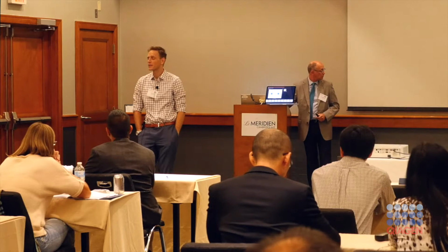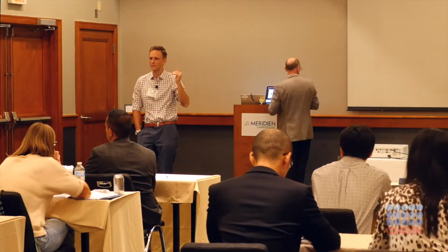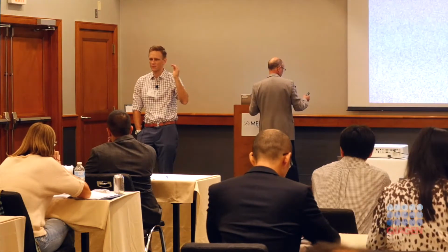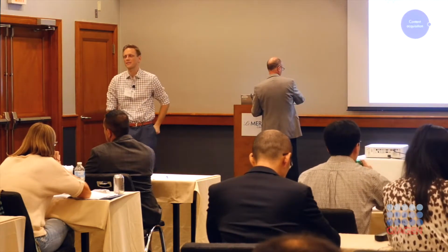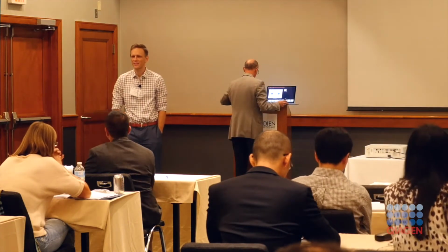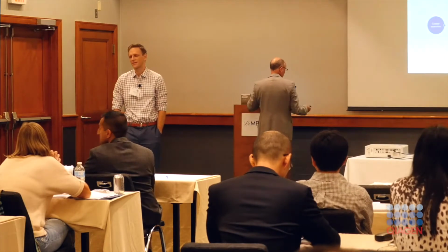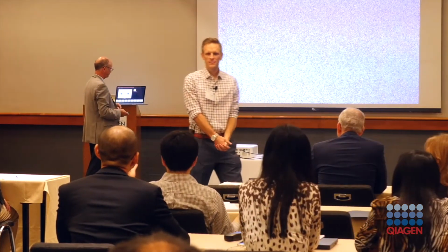I know that it's there even for the microarray options that we have in the table options, you can pre-specify the defaults for all of those different parameters. And if it isn't there, then we could definitely add it. I think it's a good idea to be able to set those in preferences. It's another one of those things where you just have to find it in the menu. Thanks. Yes, ArrayStudio and IPA are separate.